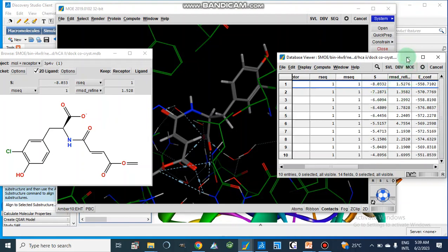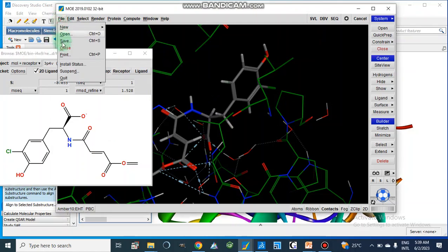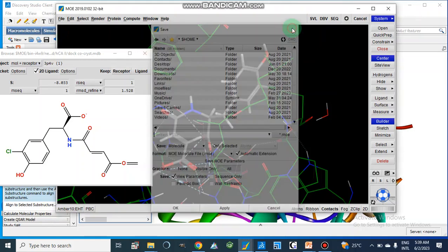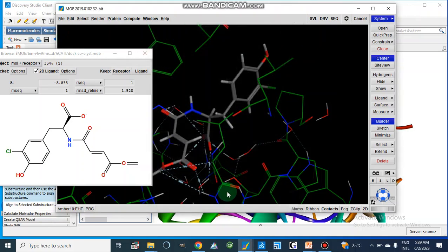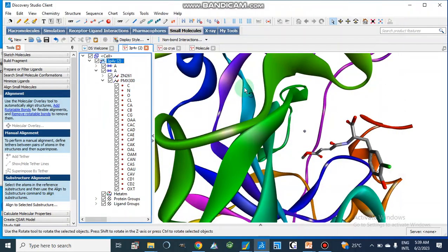This RMSD value shown here is the whole protein RMSD value from MOE. After this, we save this file using File > Save, and then we will open it again in Discovery Studio Visualizer.